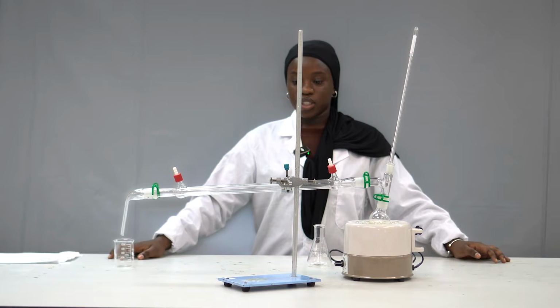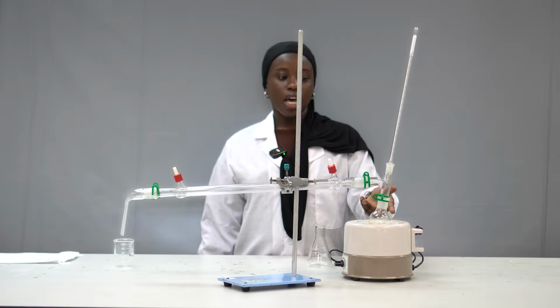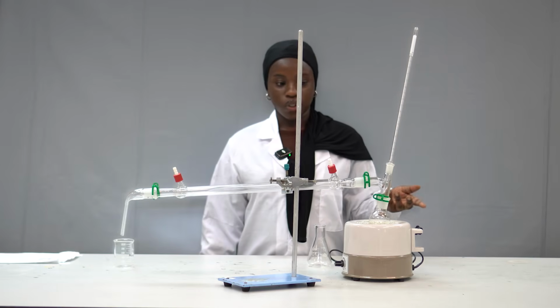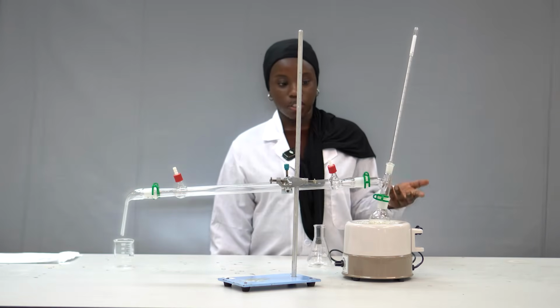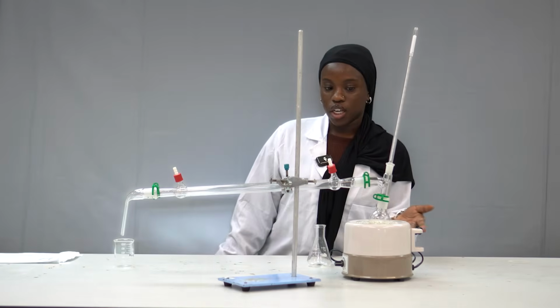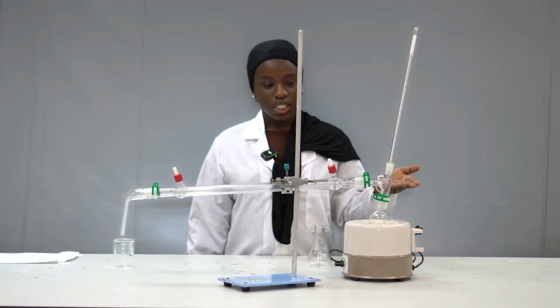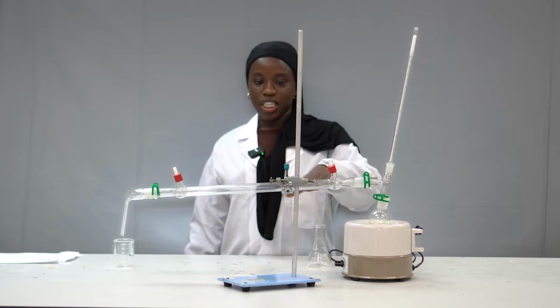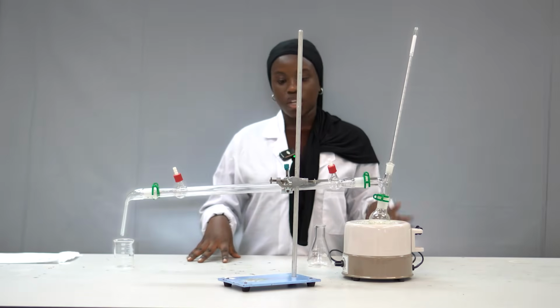Now, one of the safety precautions we have to adhere to during this process is the use of anti-bumping granules to prevent our liquid from boiling too vigorously, which can cause our round bottom flask to explode and can cause serious injuries. Another one is the addition of anhydrous sodium sulfate, which acts as a drying agent and removes traces of excess water in our organic solvent, which prevents the water from boiling at the same time as our desired product. Lastly, make sure your keck clips are secured properly so your distillation setup does not fall apart during your experiment. Now, onto the industrial uses of distillation.